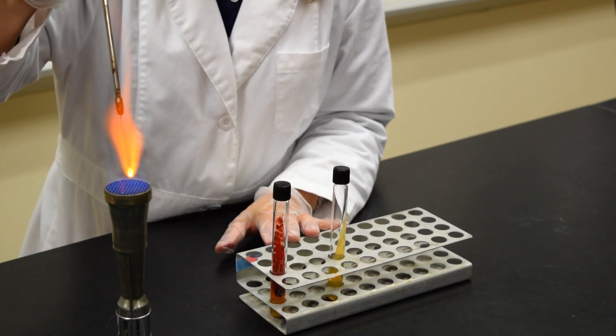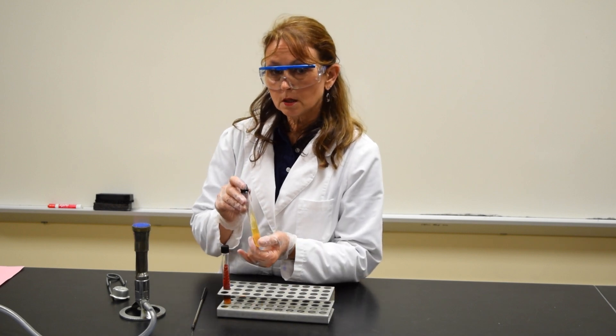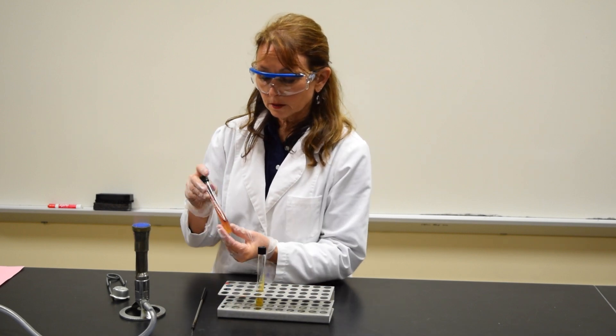Sterilize the loop. Place your tube in the incubator. In the next class period, you should find growth throughout the tube.